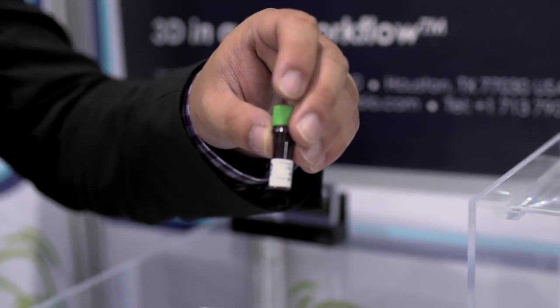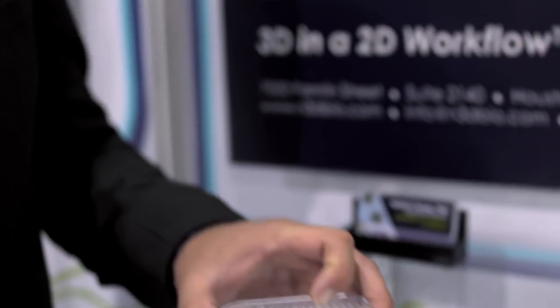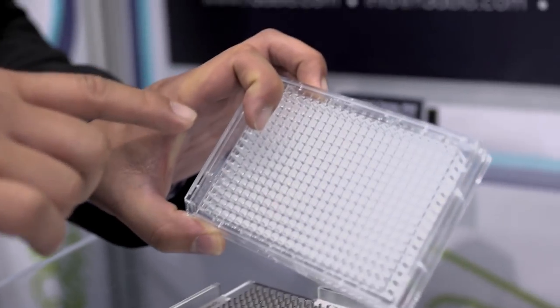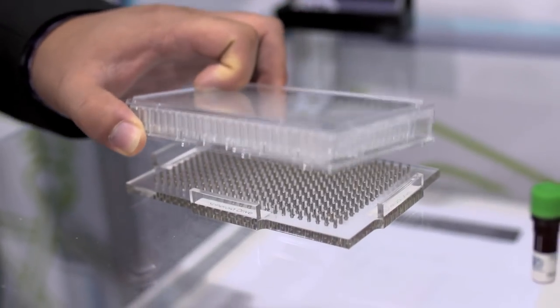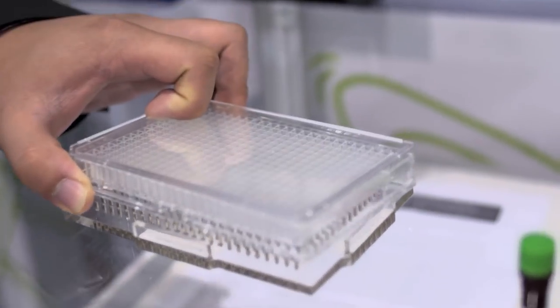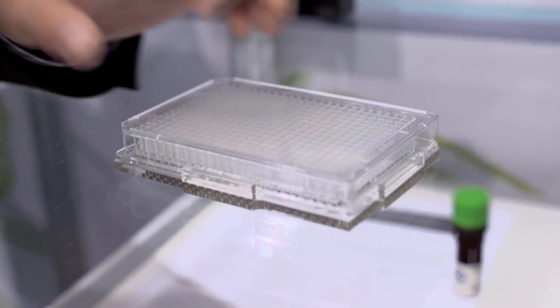All we really do is we sprinkle the nanoparticles over the cells to magnetize them overnight. The next day, we take the cells and move them into this 384-well plate. We then print the cells into spheroids just by placing the 384-well plate onto this magnetic drive, forming one spheroid per well. We leave this plate on the magnet for anywhere between 15 minutes to overnight.